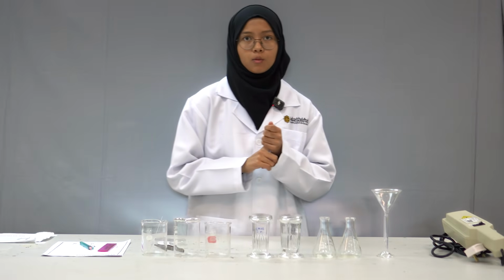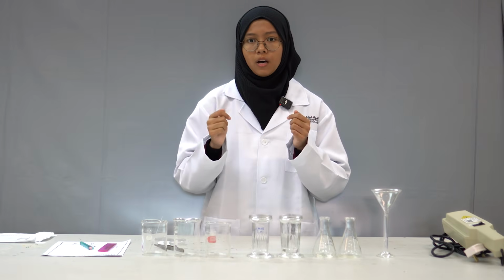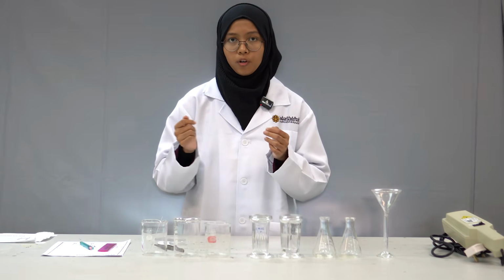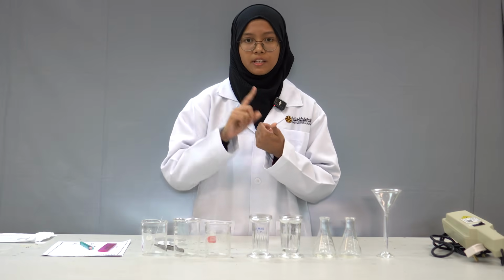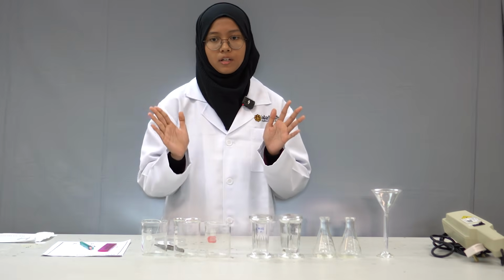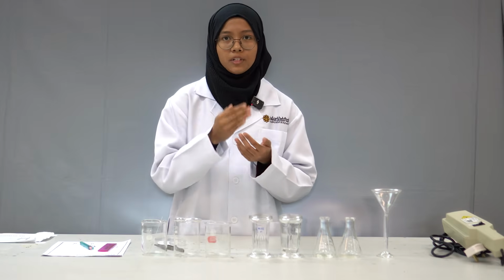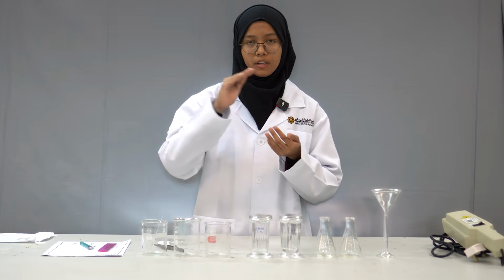In this experiment, we will have two types of developing solvent. The first one is dichloromethane and hexane, and the second one is hexane and ethanol. After this experiment is done, we will see on the two TLC plates that there is a difference in distance and Rf value, because each solvent has its own polarity. So the solvent itself also influences the movement of our compound.